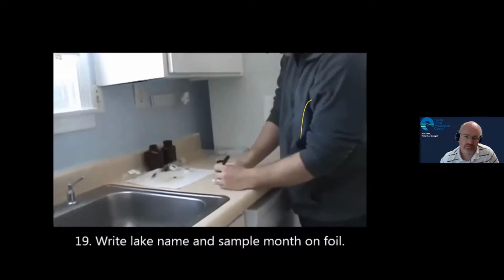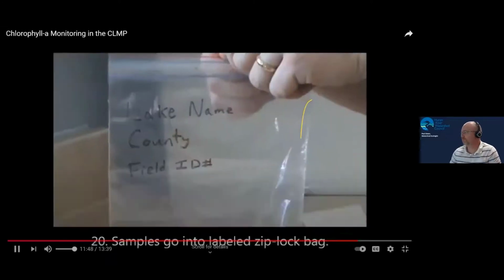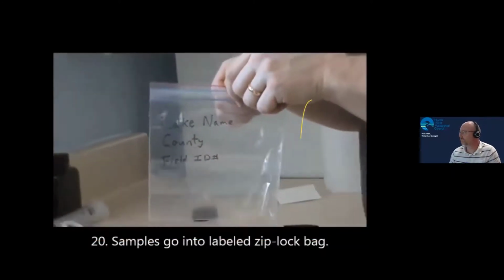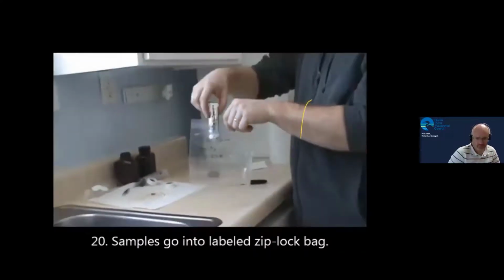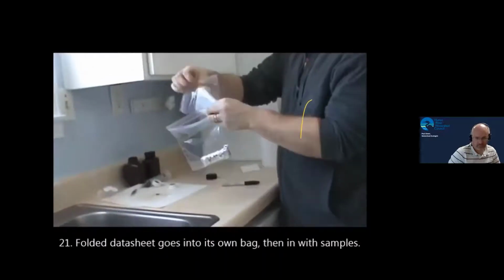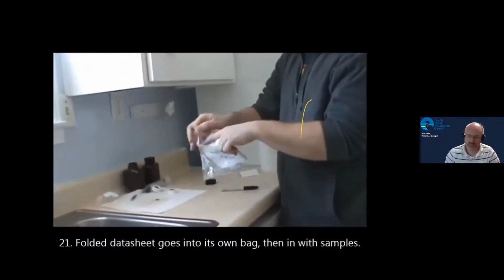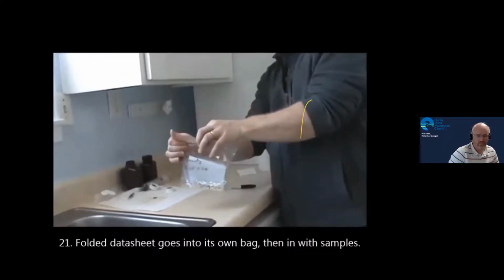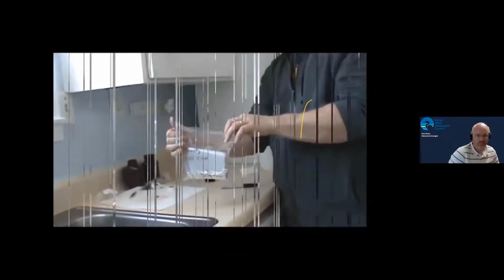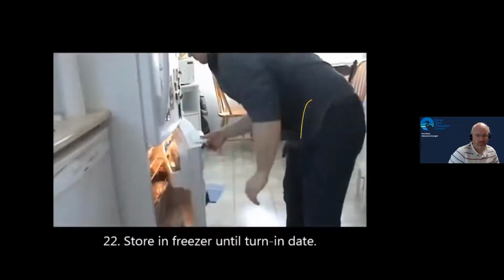Write your lake's name and the sample month on the foil packet. The samples go into a Ziploc bag with your lake name, county, and field ID number. Fold the data sheet, place it into a separate Ziploc bag so it stays dry, and place it in the bag with your samples. Storing your data sheet with the samples is a good way to make sure the paperwork never gets lost. And then everything goes into the freezer until it is time to turn it in.